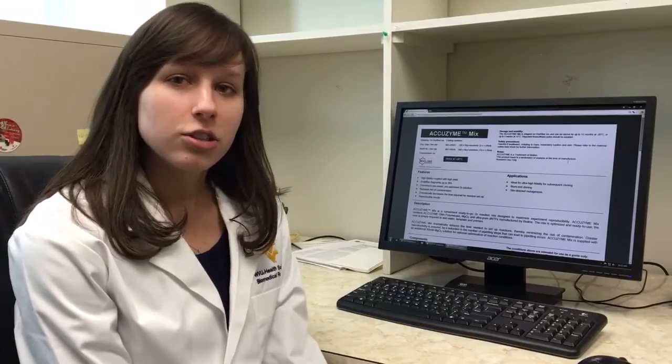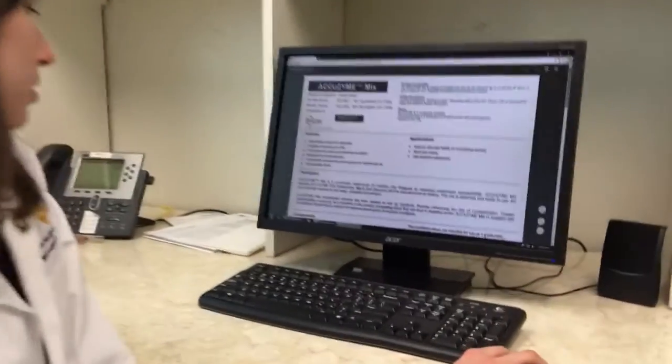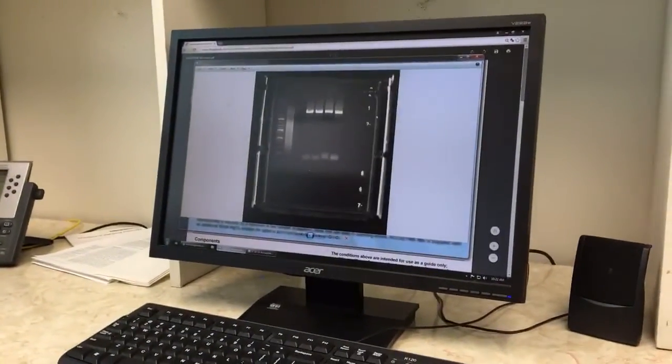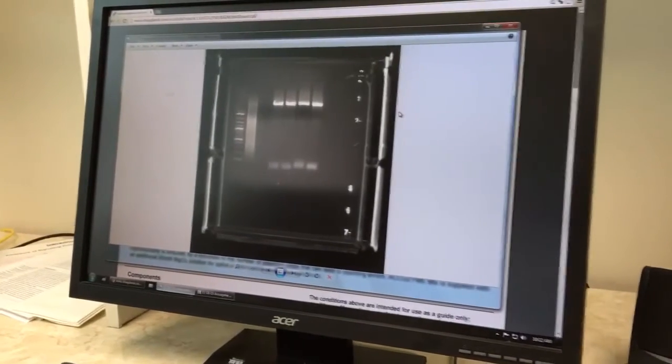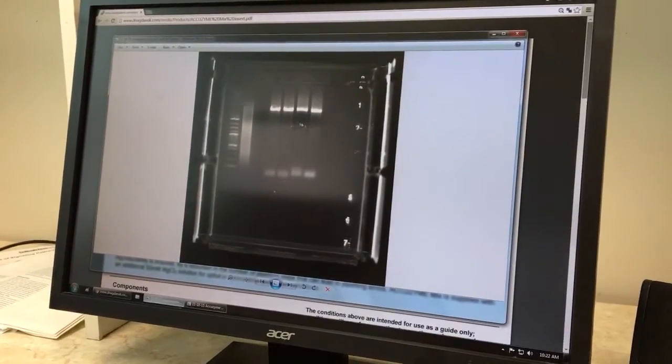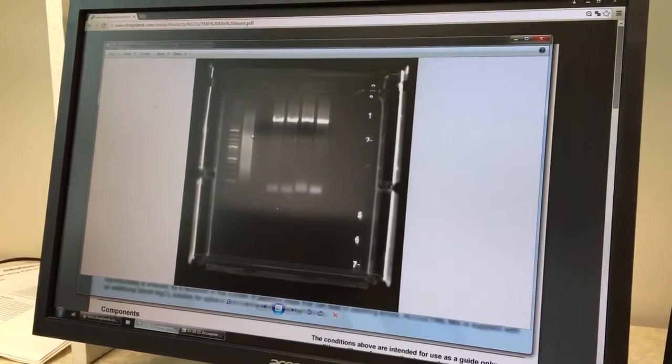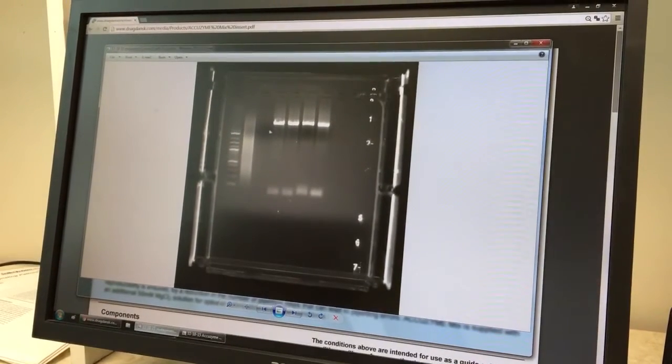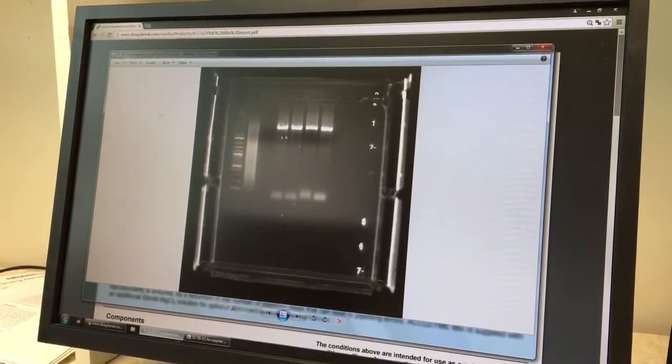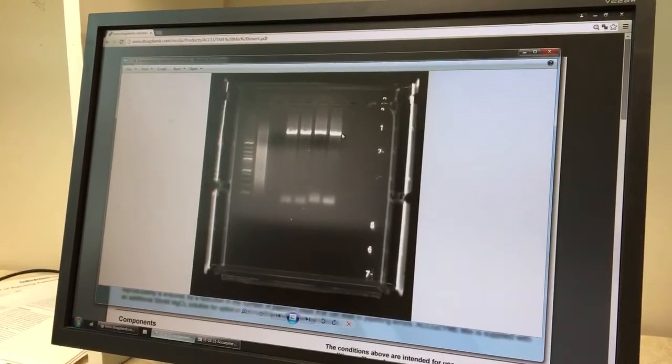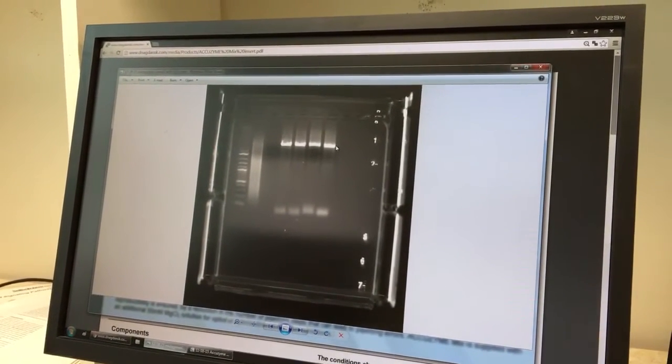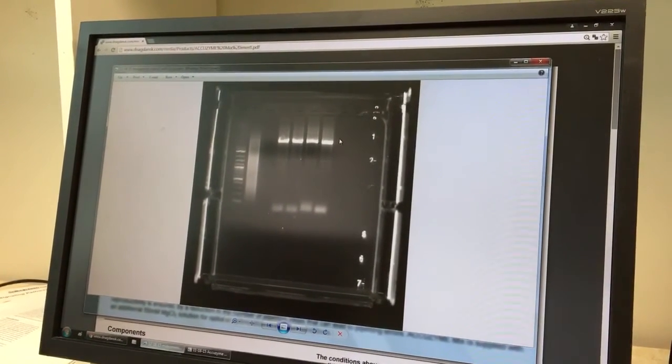So I have a couple gels I'd like to show you with my results. This first gel is my site-directed mutagenesis PCR. These first two lanes are controls and in the following four lanes you can see amplification of the plasmid showing that the PCR worked.